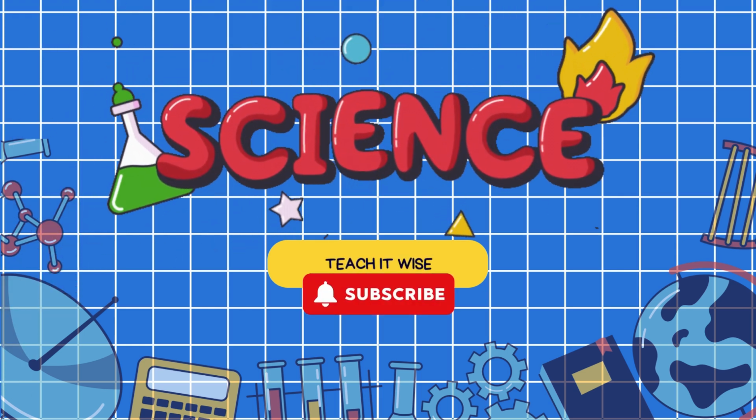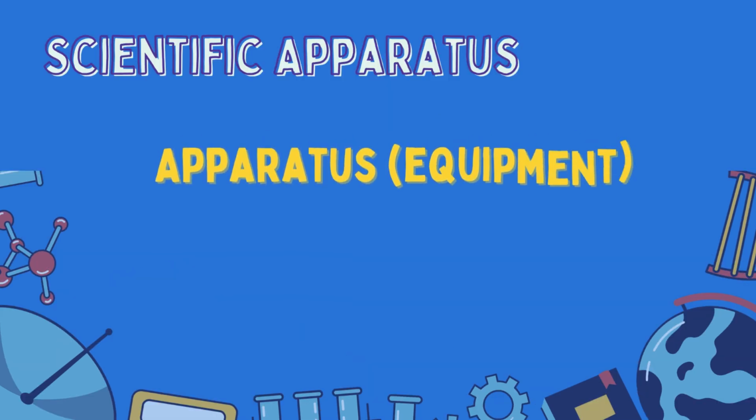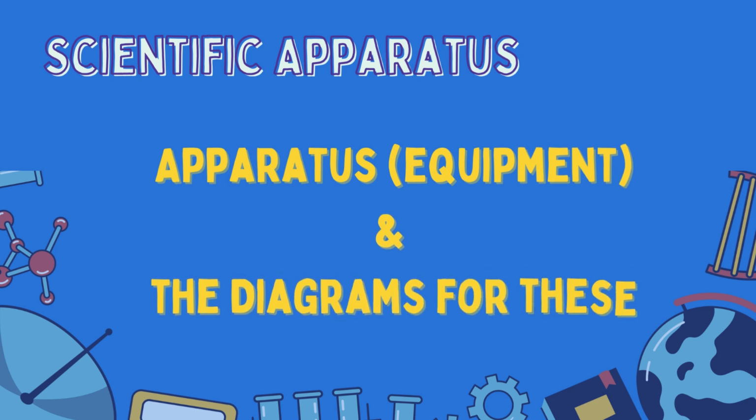In this Teach It Wise science video, we'll be looking at scientific apparatus. We'll be looking at two particular things. First of all, photographs of the apparatus, or we could call it equipment, and then the diagrams that we use to represent these pieces of equipment, and a brief description of what they're used for. So let's get started.